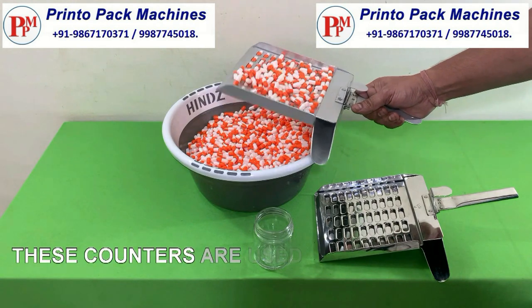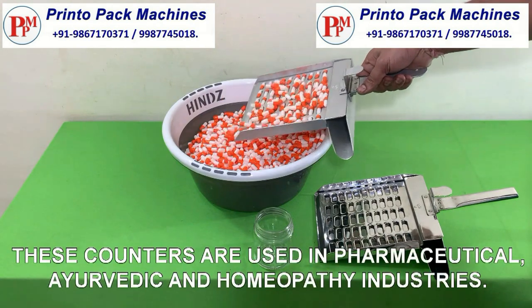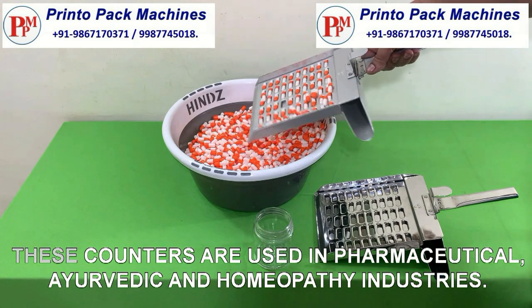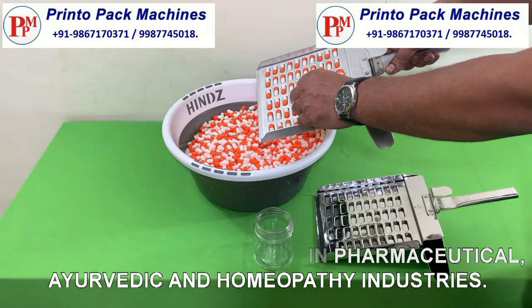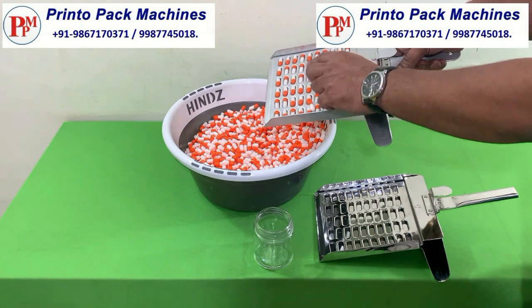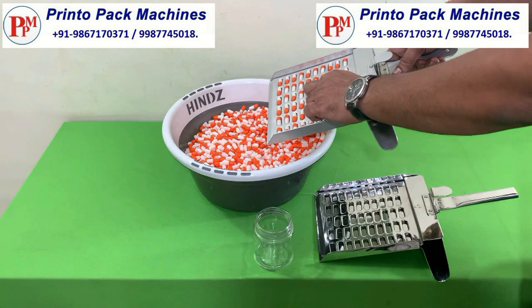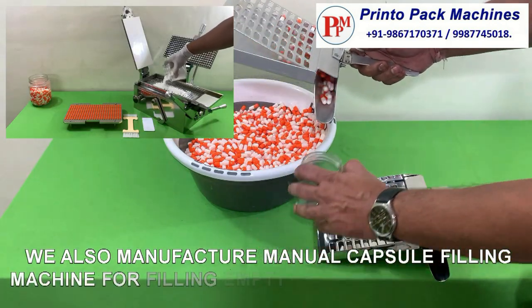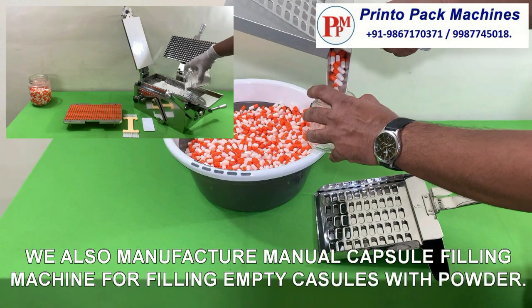These counters are used in pharmaceutical, ayurvedic and homeopathy industries. We also manufacture manual capsule filling machines for filling empty capsules with powder.